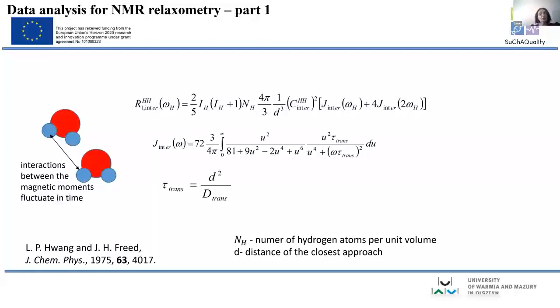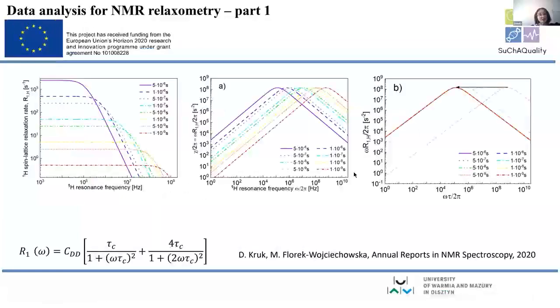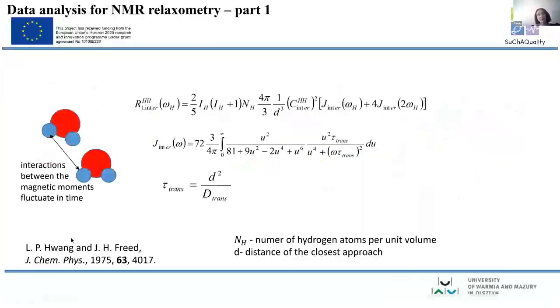And here the point is more complicated. Again, there are some formulas. The formulas are to some extent similar. You have here a function, you have here 4 times the function, here you have 3 factors. Here I have also a function, I have 4 times the function. Here I have a kind of prefactor. I do not want to go into this subject right now. I only want to tell you that the form of the expression becomes much more complex in case of translation diffusion.